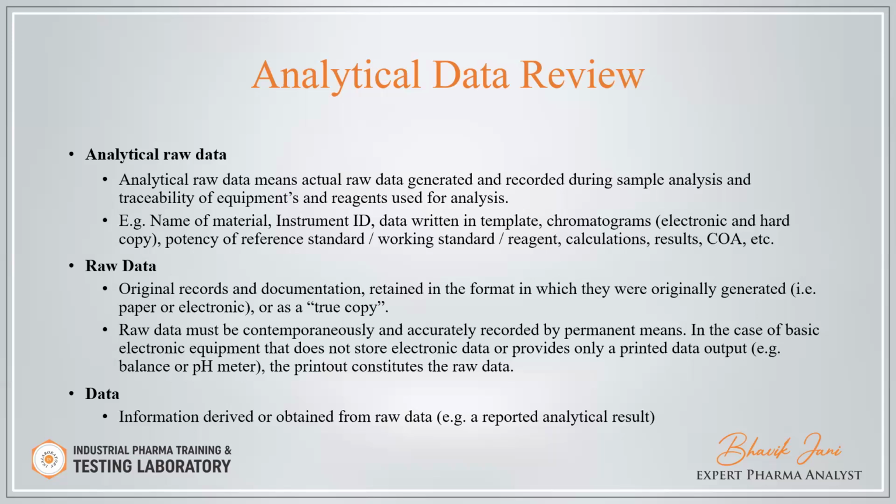And the raw data means only the original record and documentation written in a format in which they were originally generated, or as a true copy. Raw data must be contemporaneous and accurately recorded by permanent means.